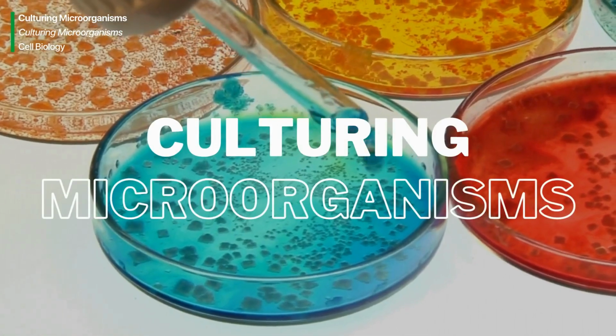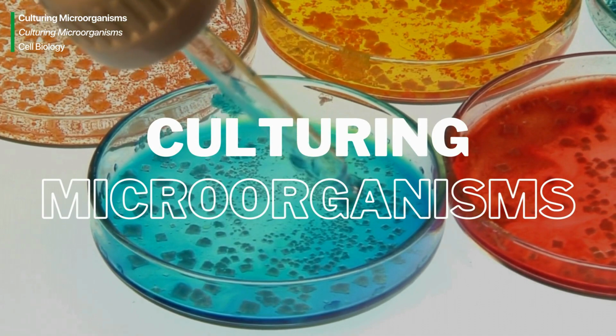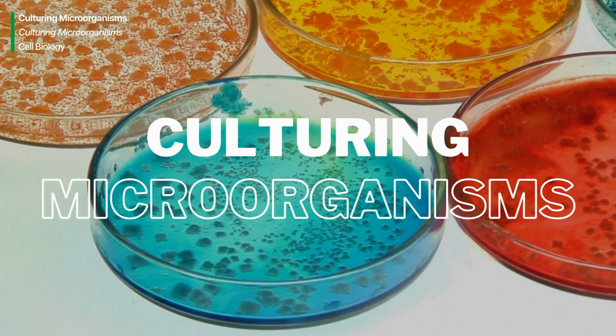Welcome to today's lesson on culturing microorganisms. In this session, we will explore the techniques used to grow bacteria and understand the laboratory methods involved in the growth and study of microorganisms.